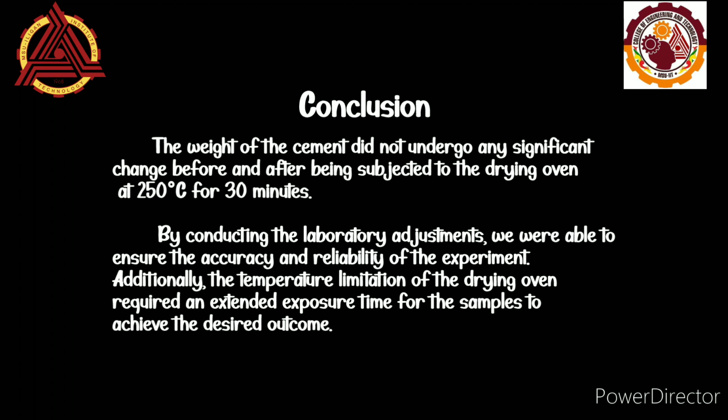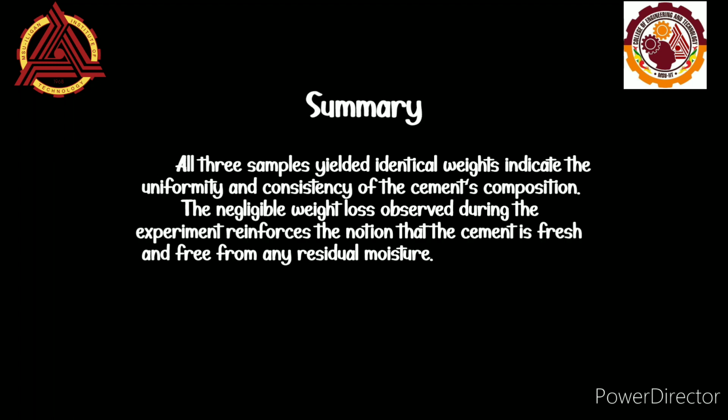The controlled environment provided by the air-conditioned laboratory room necessitated the preheating of the drying oven, guaranteeing consistent and precise results. Additionally, the temperature limitation of the drying oven required an extended exposure time for the samples to achieve the desired outcome. The fact that all 3 samples yielded identical weights indicates the uniformity and consistency of the cement's composition.